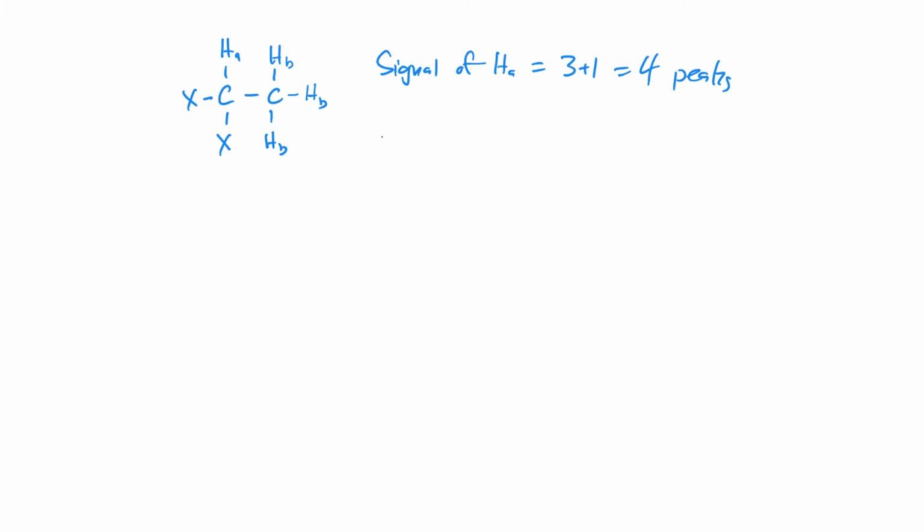So the first possibility, of course, is that they are all aligned together. Then we can have one of them aligned against the instrument, and there's three different possibilities of the same setup. We can have a different one of the three HBs aligned against the instrument. And so you see that each of these are considered to have the same energy, and so they will actually add to each other, and their effect will appear at the same chemical shift when we look at the signal for HA.